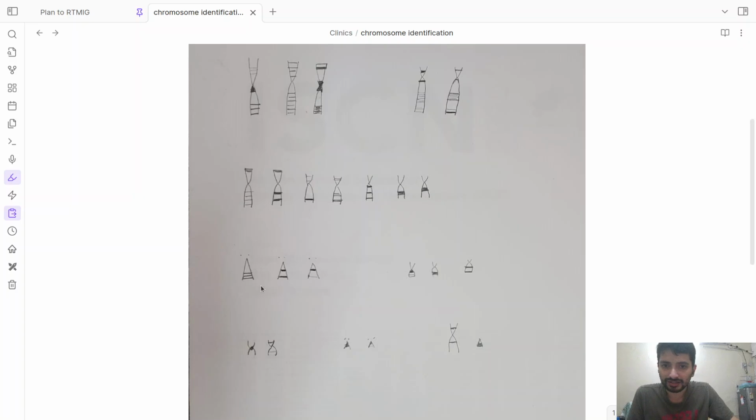Finally, coming to the smaller ones. So the D group contains three chromosomes of similar size, and these are acrocentric chromosomes. So far, we have seen metacentric and submetacentric chromosomes, but these are now acrocentric chromosomes, which means that the centromere is towards the very end of the chromosome, and then you might be able to see some satellite portion of the DNA of the chromosome as well.